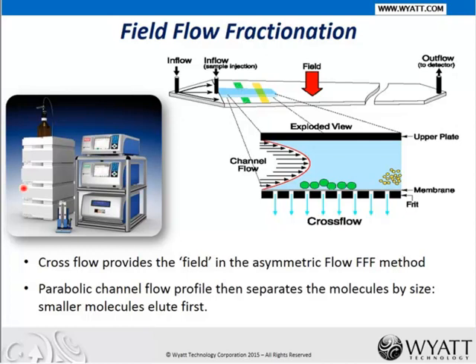Here is a picture of the FFF setup, and we can see they share many common components as the SEC setup, the same pump, auto sampler, and the suite of detectors. So actually, if you have a FFF system, then you can also do SEC. So you can do both SEC or FFF separation in the same system.